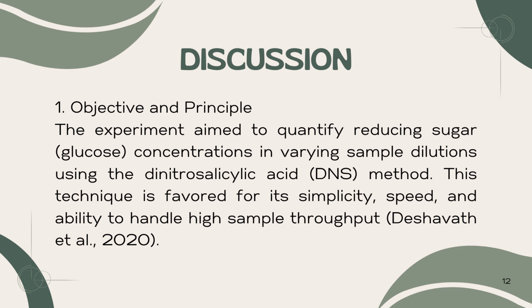Discussion. 1. Objective and principle. The experiment aimed to quantify reducing sugar concentration in varying sample dilutions using the DNS method. This technique is favored for its simplicity, speed, and ability to handle high sample throughput.